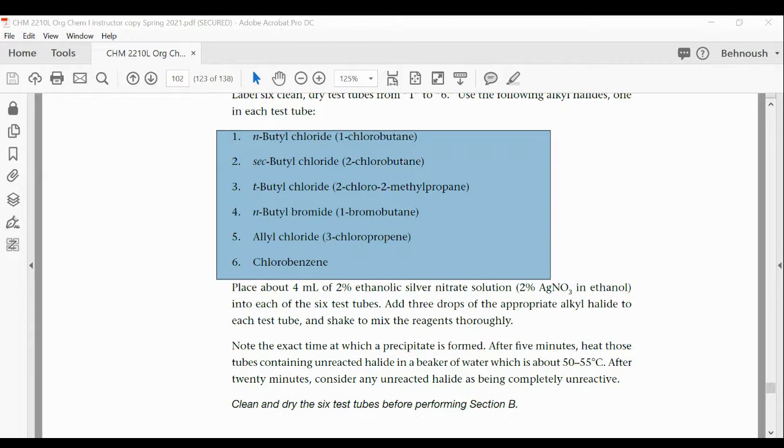Yes, it could be, it's vapor and it's very volatile. Normally it's that the apparatus is open, there is a leak, but for this experiment specifically, you could say condensation also was not efficient. Okay, I'm going to stop recording.